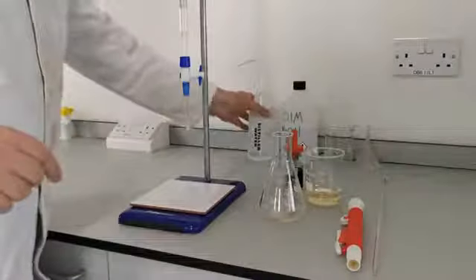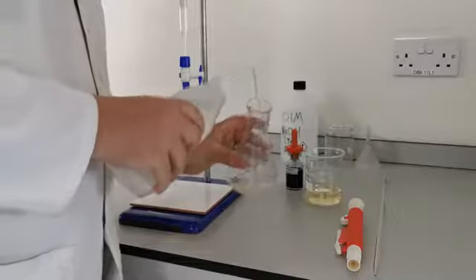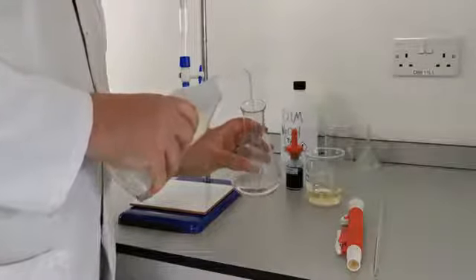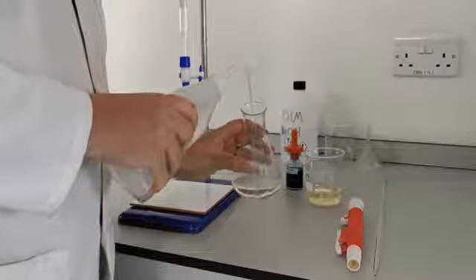Next, we add some distilled water to the sample. It doesn't matter how much you add here, because the amount of acid in the conical flask remains the same. It's simply done just to make the colour change easier to see.